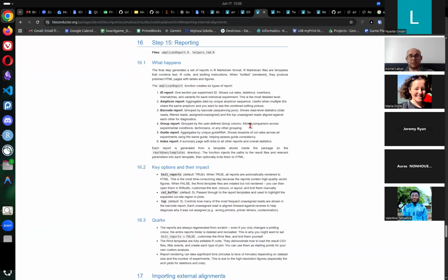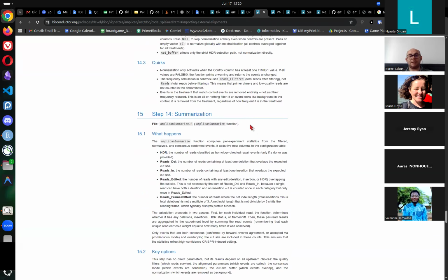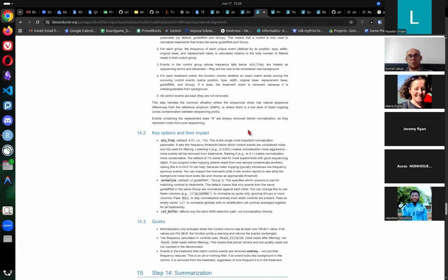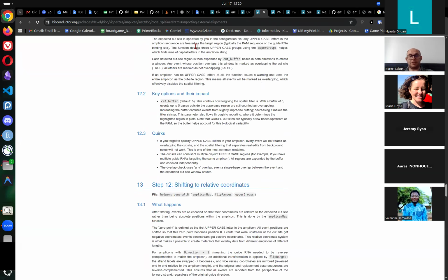which is sort of, if you want to read a little bit how it works, this is a very good reference. You don't need to read the code line by line, but just read this if you want to. It's not that long, I think.